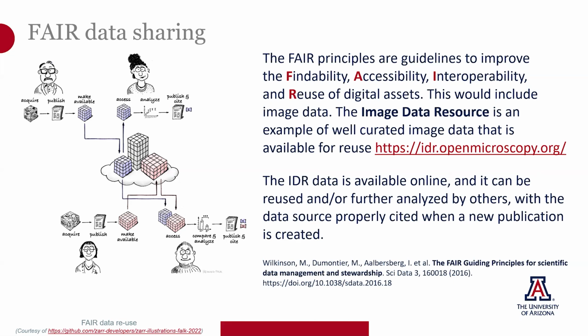A lot of big meta-analysis in clinical studies use these sort of things where they pull data from multiple studies and try and come up with, in a sense, a larger pool. The image data resource is an example of well-curated image data that's available for reuse, and it's online, and others can use it, as long as they properly cite the original author or lab that created the data.